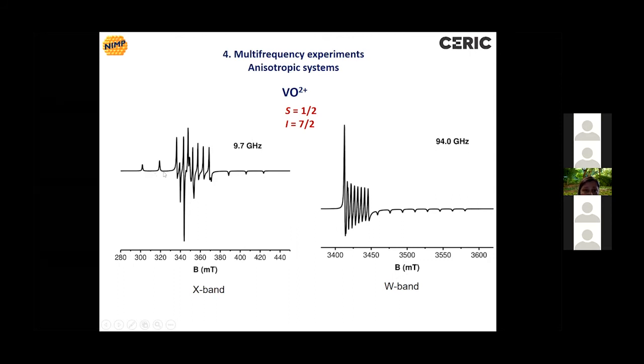You see that the spectrum is quite complicated, that the hyperfine structure from the parallel line is overlapping the one from the perpendicular line. So as I mentioned in the course, in a powder spectrum, the parallel component is the one with the lower intensity and the perpendicular one is the one with the higher intensity, because there are more contributions to the perpendicular part.